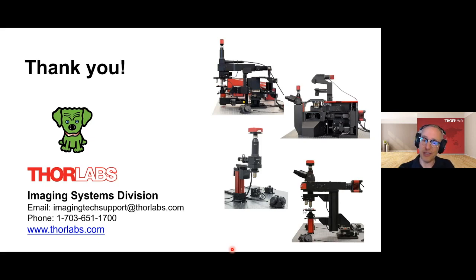On the collection side, it's ideal to set up two different types of collection paths. We talked about how the confocal collection needs to be descanned in order to relay the light through the pinhole to the detector. That pathway is inefficient, so for multiphoton imaging you would be losing a lot of light. You really want that dichroic sitting directly behind the objective to send all those emitted photons directly to another detector, so that you have more efficient collection of light for your multiphoton path. So it is possible to use the same path, but it's not ideal.